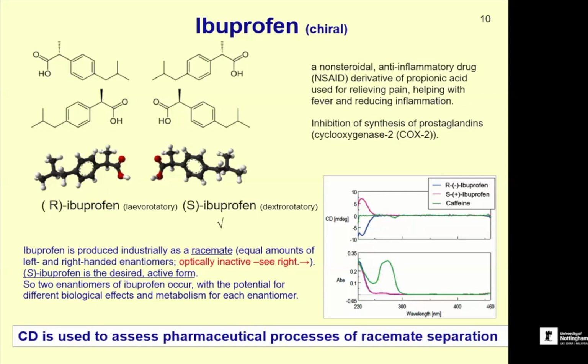Maybe get a solution of the racemate with the other chiral molecule, and then you could get different polarized light and see the complexes they get. Yes. And see the possible cases. Yeah, you can monitor it, which is what this slide, is that what you mean?